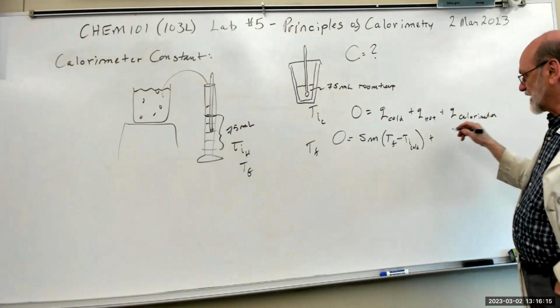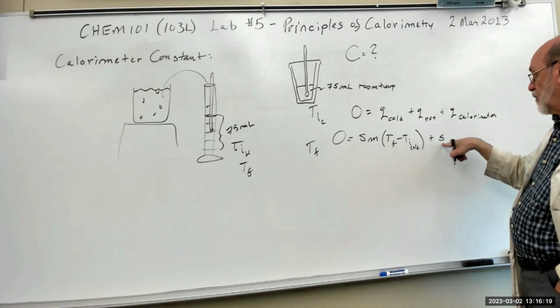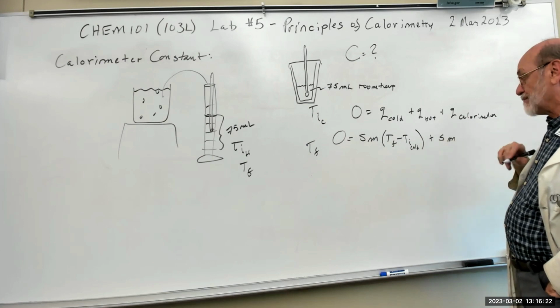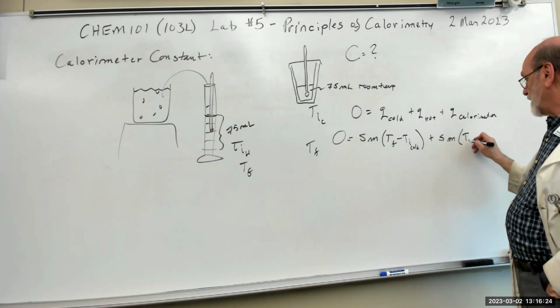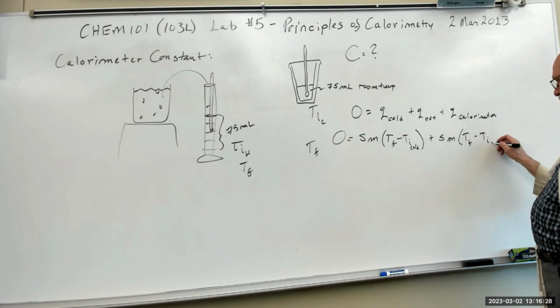Okay. We do the same thing for the hot. We have the same value here for that water. We have the same mass, have the same final temperature. We have a different initial temperature. Hot.